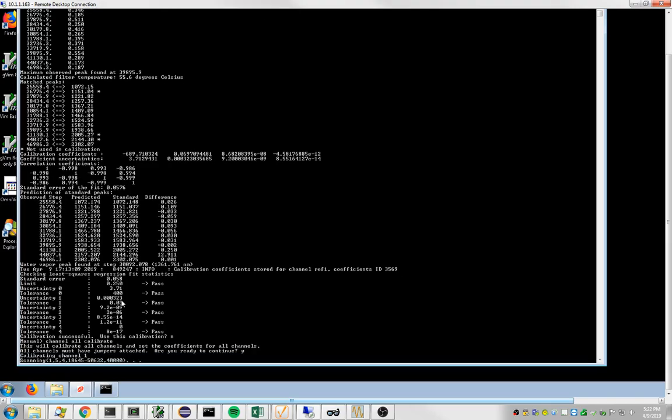And now it's going to perform calibrations on all channels. Now this will take a few minutes.